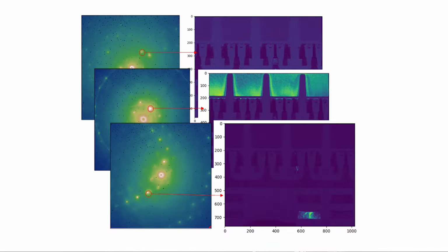So you need just one go for this. You collect all the data at once, and then in the post-processing you can do many things. If you're interested in a virtual aperture, virtual segmentation, or even see the individual diffraction pattern per spot. Cool. So it works both ways. I can click either in this image and get the diffraction. Yes, exactly. Or click in the diffraction and get the image. Yeah, and select an area on your detector, and then it's the selected area diffraction imaging.